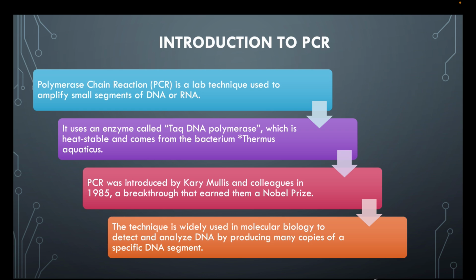What is PCR? Polymerase chain reaction is a common laboratory technique used to make many copies, many means millions or billions of copies, of a particular region of DNA. Particular region means our DNA is 2 meters long and has different kinds of genes, but when it comes to studying a specific gene, that's how we amplify that targeted genic region. We target this gene and amplify it, make a number of copies of it.